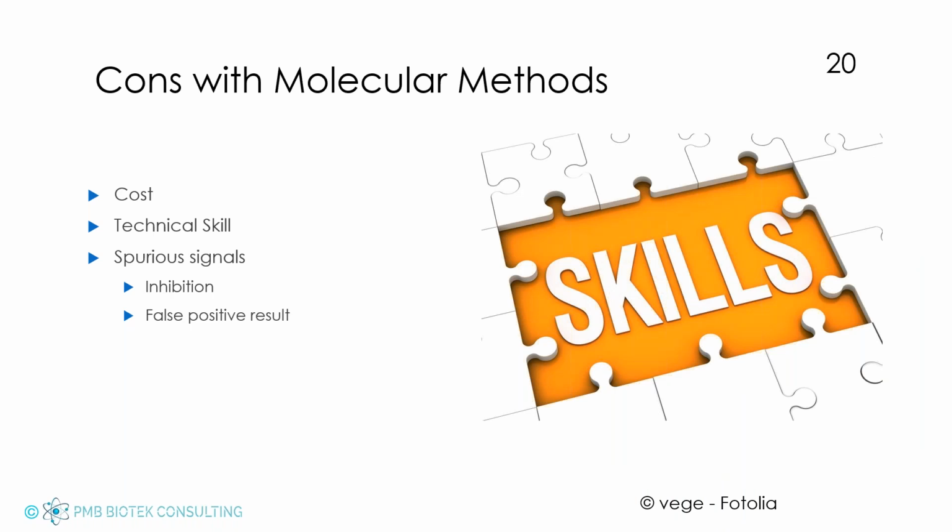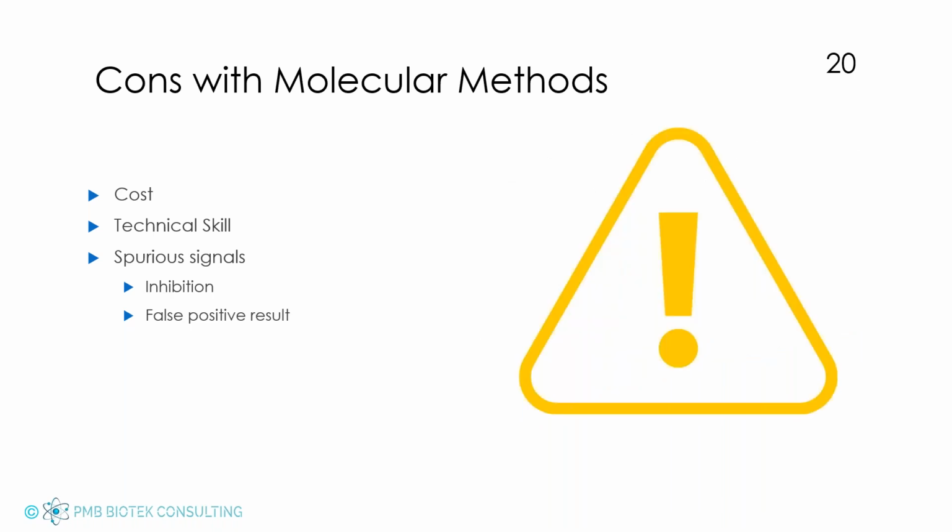So a lot of times the micro lab is the afterthought within the operations build out of a cannabis lab, and identifying individuals that have previous experience, whether it's in the food, clinical, or other cannabis labs, is key. And then lastly, and why we're here today, spurious signals.